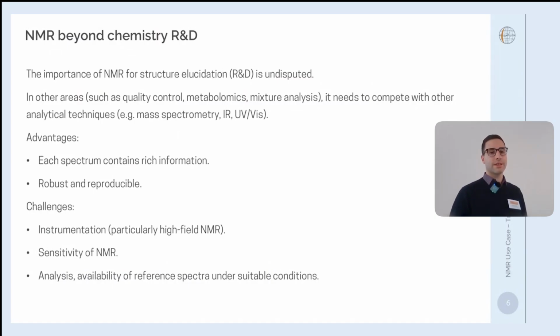more difficult game to play, because on the one hand, yes, the spectra contain extremely rich information. They are also very robust and reproducible, but one challenge certainly is the instrumentation. If you have such a complicated device that you need to put somewhere, in many institutions that's not even available. That is, however, something that can at least to some extent be addressed with benchtop NMR spectrometers.